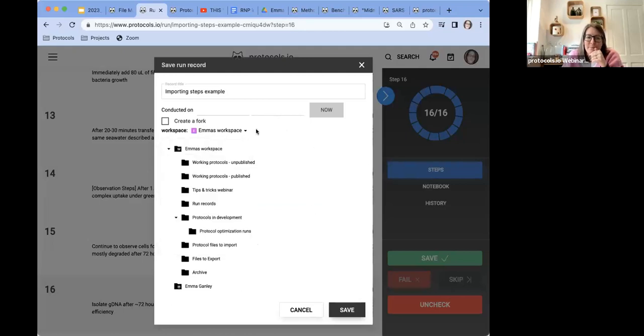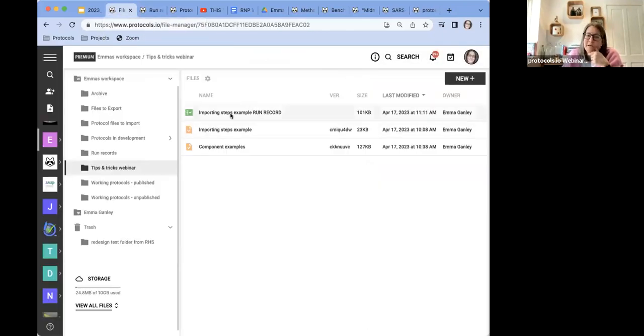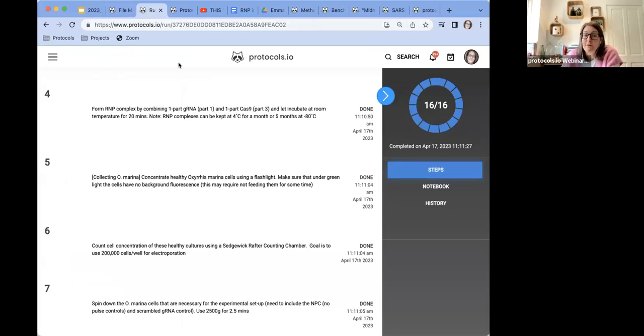So I will just put this into my tips and tricks webinar, so you can have a look and see. And I'll say conducted on now, so it will give me a date and timestamp for the run as well. So now if I go back to my file manager, there we are. There's the run record that was created today by me, and it's a different color, so you know that's a run record. So it's a really cool way of being able to perform the protocols that you've imported this way.